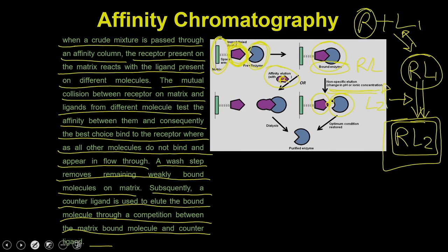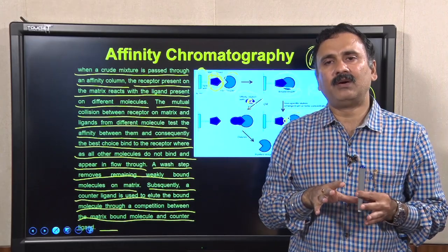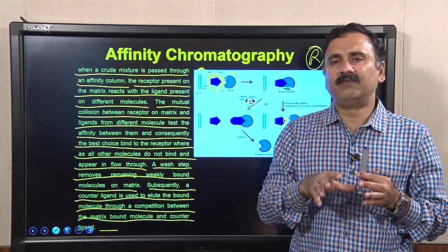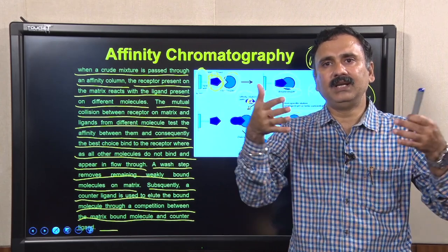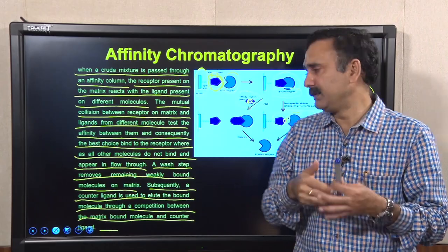So this is the basic principle through which you can exploit the affinity phenomenon to purify different complexes, exploiting the receptor-ligand concept or the affinity concept.